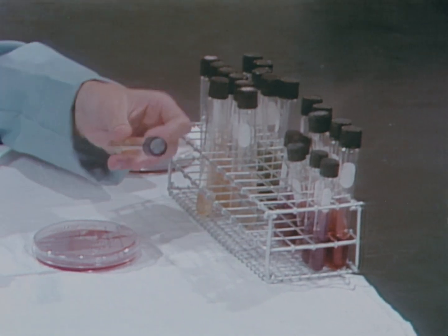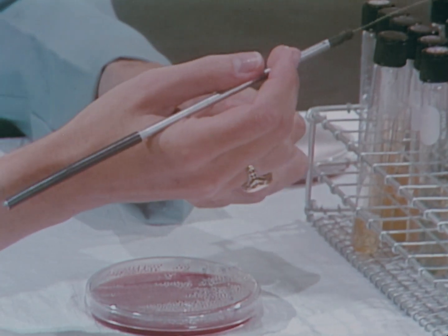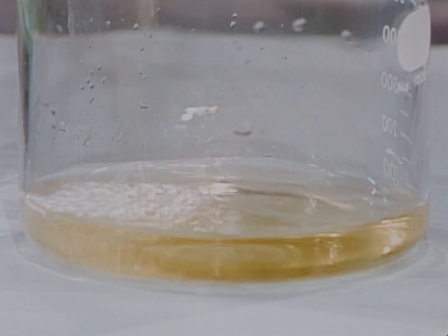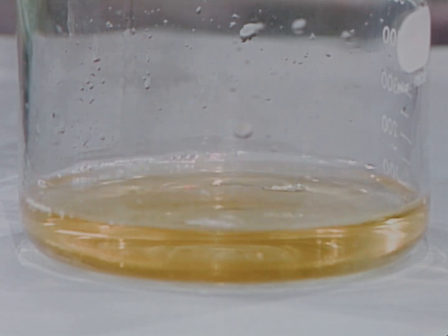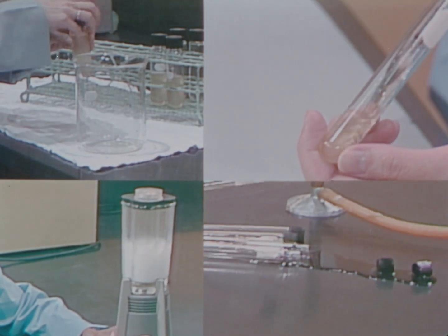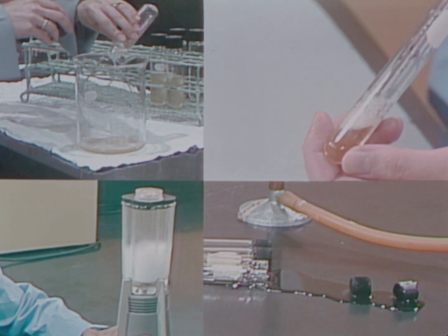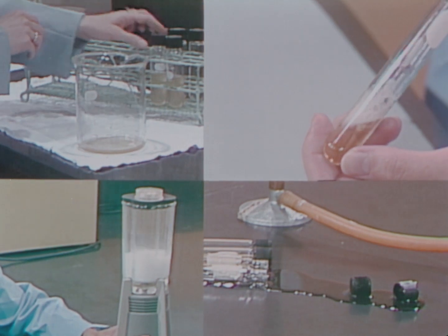Contamination can also result from the surface film breaking when screw-top tubes are opened. Additionally, surface contamination may result when supernatants are decanted. This happens when a solution is poured into another container and large aerosol droplets form. Large droplets may settle on any surface in the laboratory. Remember, droplet nuclei which are smaller may drift over considerable distances.